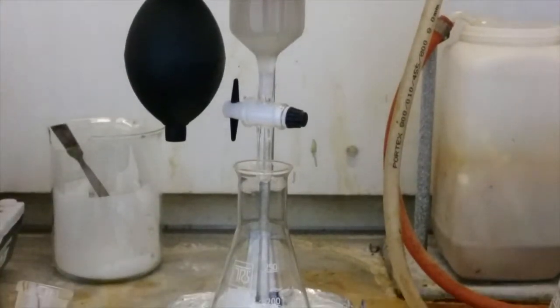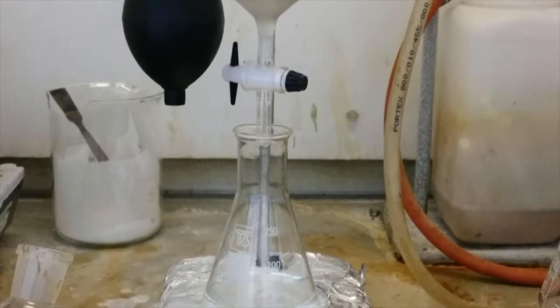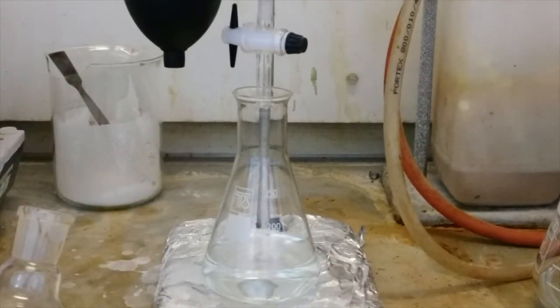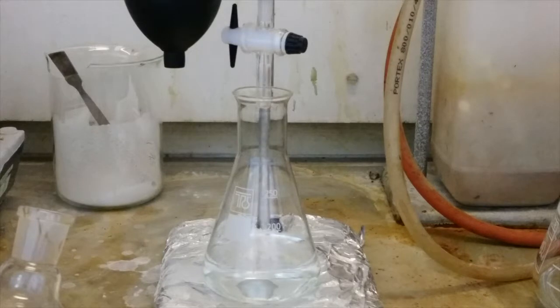You should also now begin collecting the solvent that elutes from the column as fractions. At this stage you can collect fractions of 100 mils or more however as your product begins to elute you should collect much smaller fractions of less than 50 mils to ensure no contamination of your product.